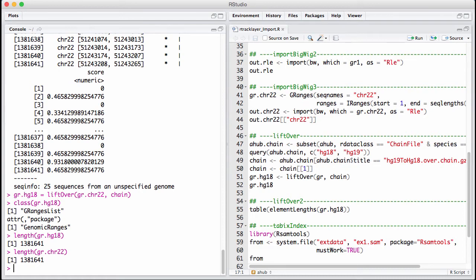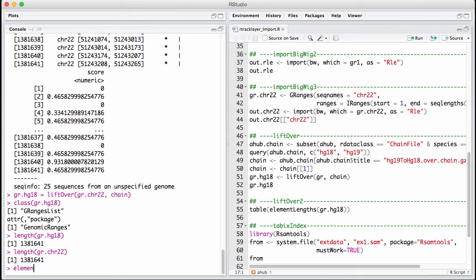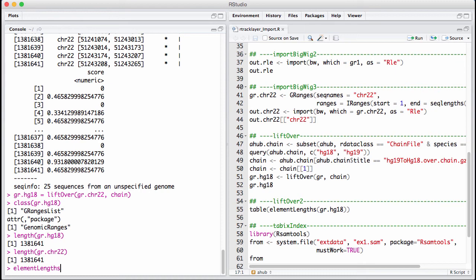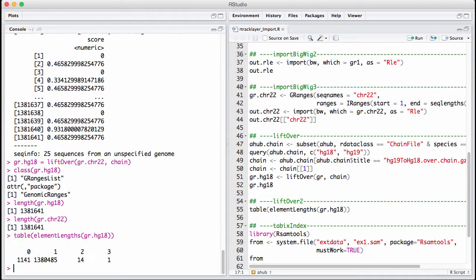We can ask how often did our ranges get broken up. For that we just need to know how long each element in the GRangesList is. So let's do that with element length of gr.hg18 and do a table of this. We see that by far most of the intervals we lifted over got mapped one to one. There's 1100 intervals that we couldn't lift over from hg19 to hg18, and there's 15 intervals that got broken up into two or three pieces.